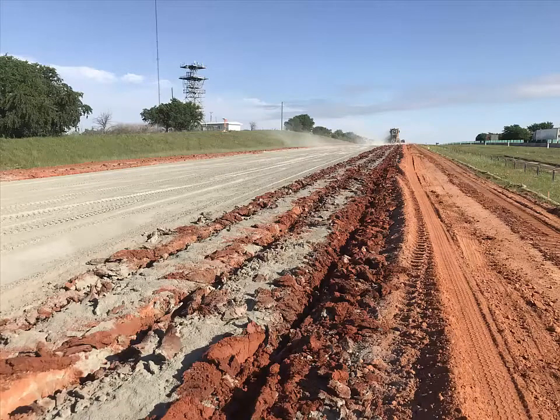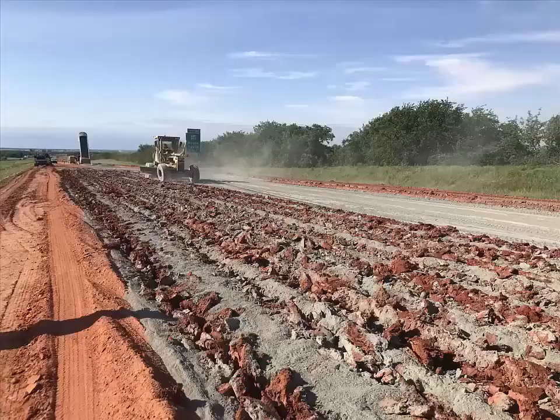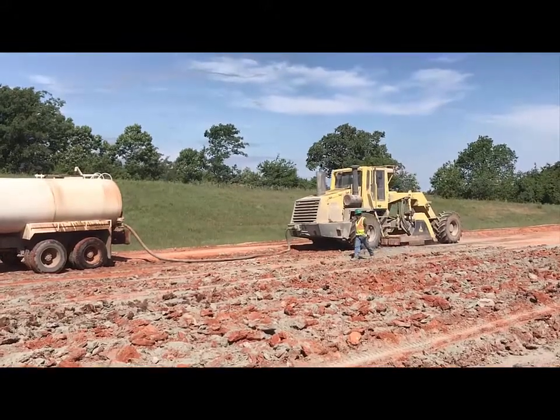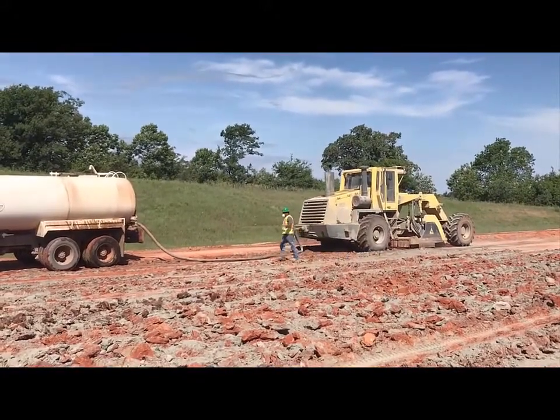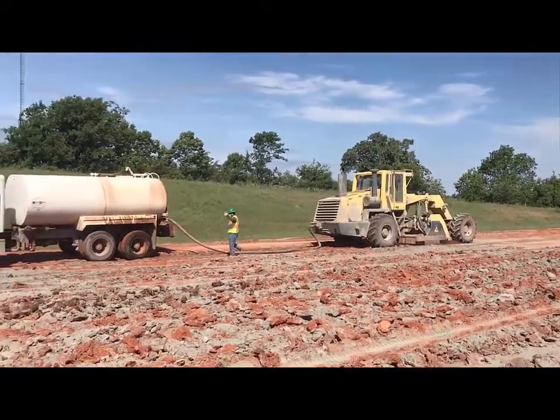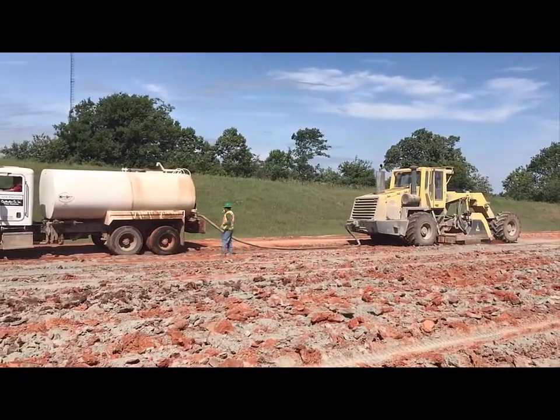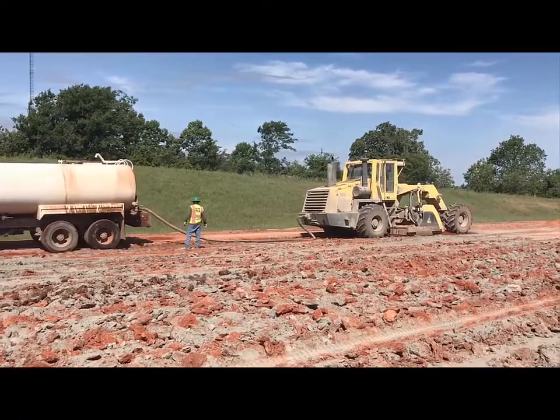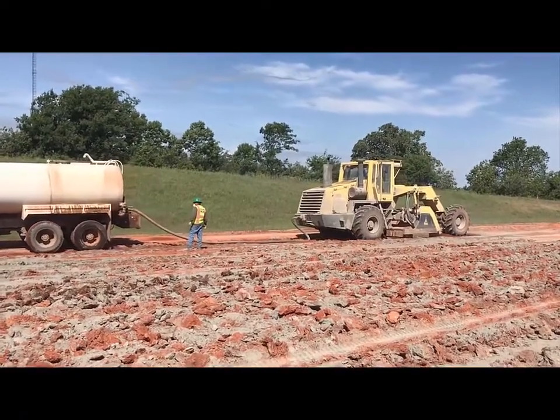One of the interesting things about X-ray fluorescence is that it's an elemental test, so time doesn't matter after sampling. We've proven this technology with whole rock analysis, which involves melting that soil down into a fused disk and sending it off to a laboratory to get analyzed.